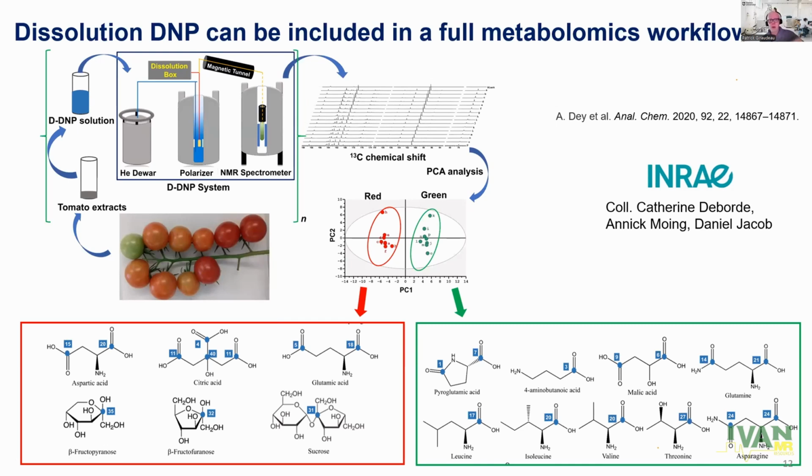And the results were very good. We were able to separate the different samples as expected, and also to identify markers of this separation. There was no new biological information at that time, but we were very happy to show that in spite of a very complex experimental setting, we could yield very reliable analytical information.